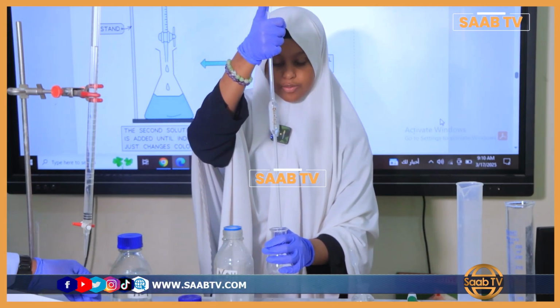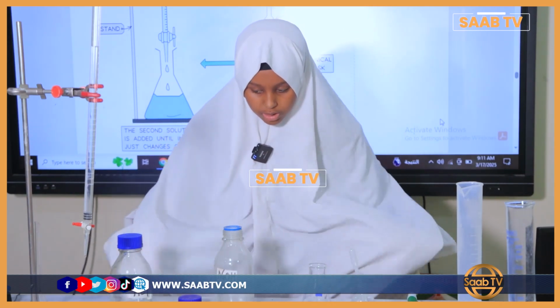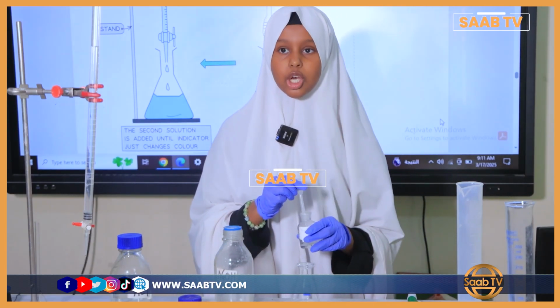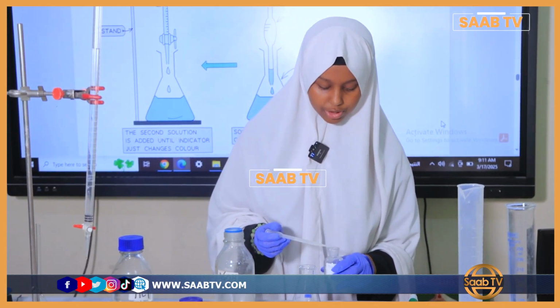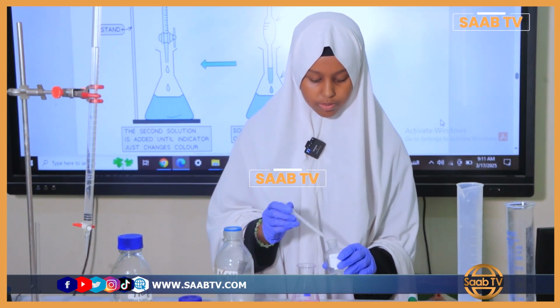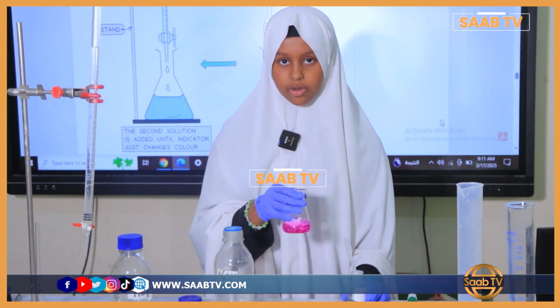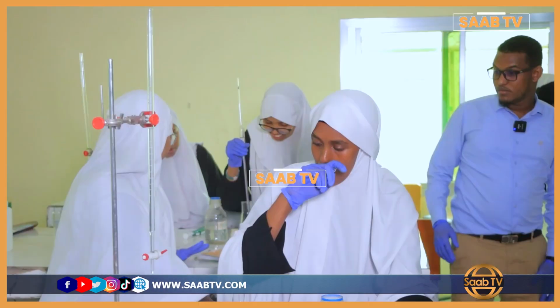So we're going to transfer that to the conical flask. Now we have exactly 25 centimeters cubed of our alkali, sodium hydroxide. Now we're going to add 3 drops of phenolphthalein, which is an indicator that shows the pH, whether it's alkaline or acid. We only add 3 drops because if you add too much, it might interfere. The color changes to pink when it's an alkali, so you can clearly tell that sodium hydroxide is an alkali.